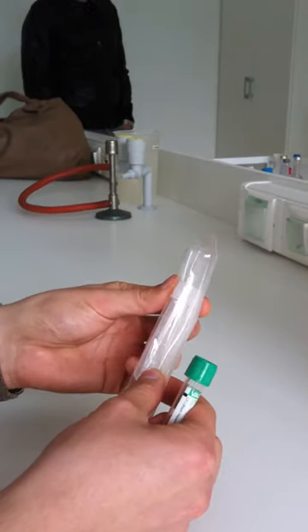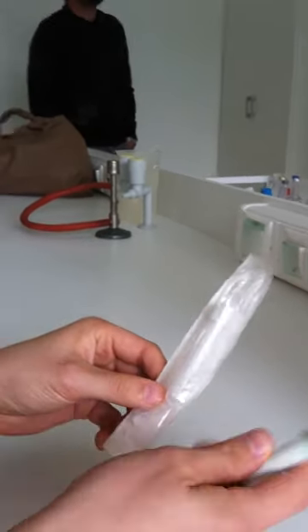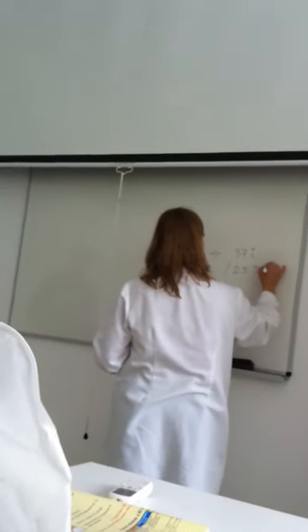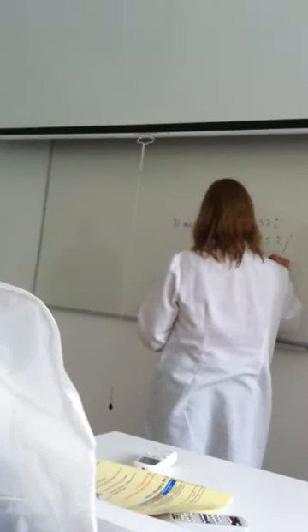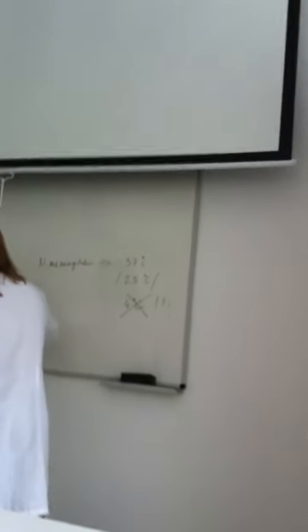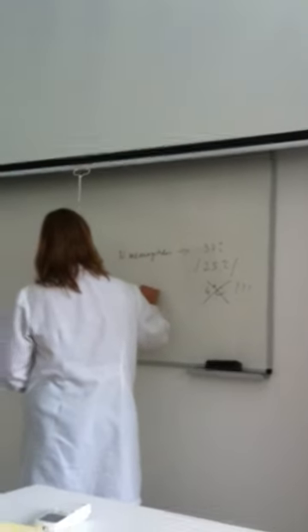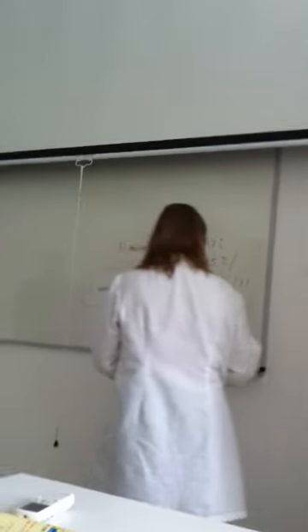Sometimes, if there is a suspected Neisseria meningitidis, the best temperature is 37, but if it is not possible, then room temperature, but never 4 degrees, because it will kill the bacteria. So never. Only in case of Listeria monocytogenes. This can grow at 4 degrees. The others die.